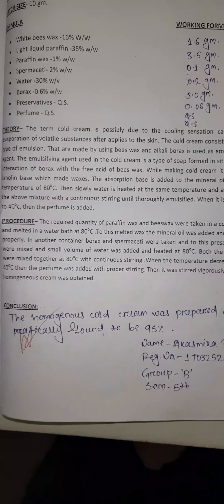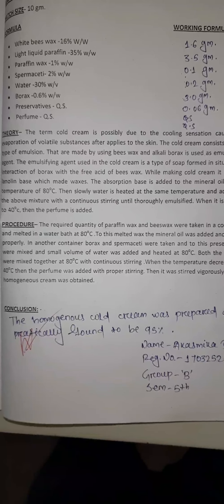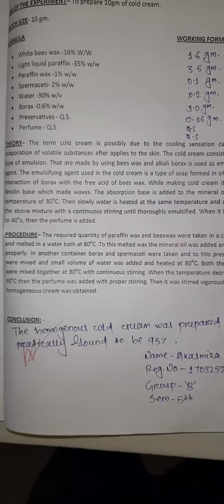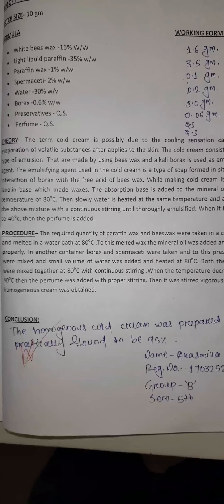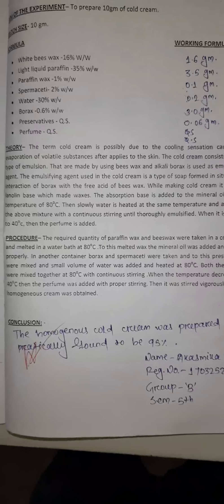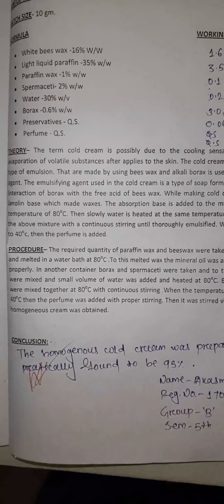When the temperature decreased to 40 degrees centigrade, the perfume was added with proper stirring. Then it was stirred vigorously until a homogenous cold cream was obtained.